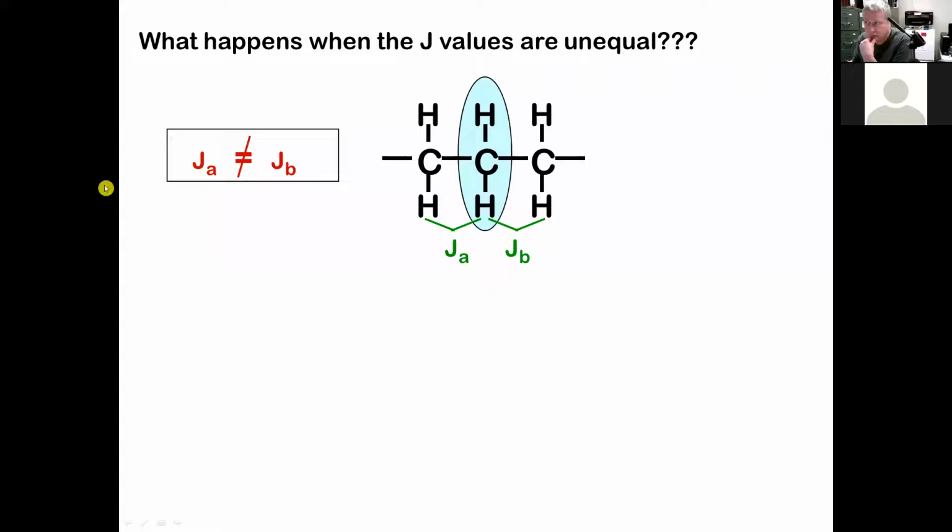Okay, recording. You see the NMR screen? Yeah. Cool. All right.